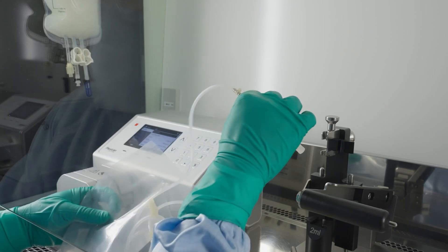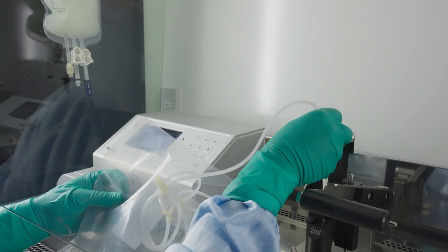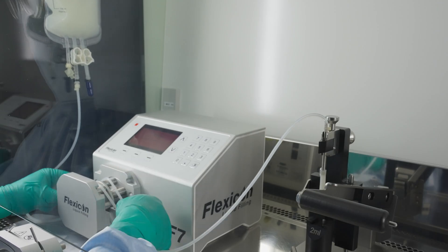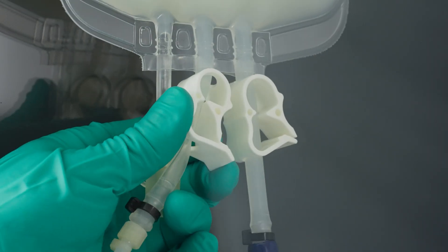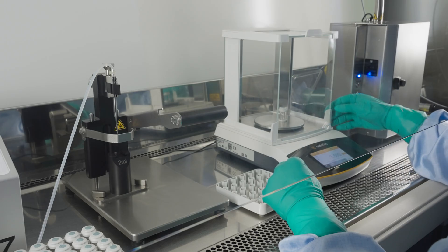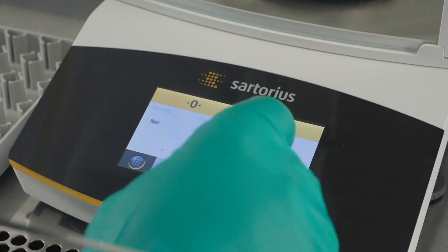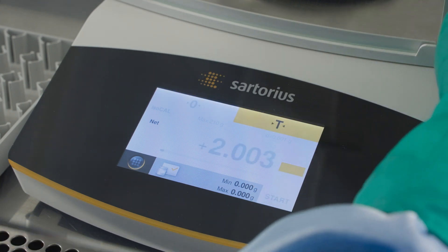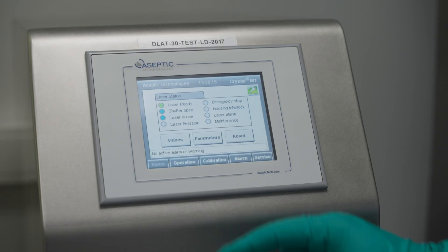The operator prepares the batch by installing the filling kit, a single-use system of a filling needle and tubing. He then performs the calibration of the dosing system and of the laser.